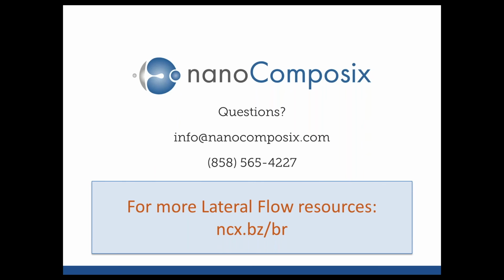Our first question comes from Andrew. For a competitive assay format, what conditions do you recommend for conjugation? For a competitive assay, we highly recommend covalent binding for the conjugate. For competitive formats, it's really important to limit the amount of antibodies per particle because that can actually improve your sensitivity. Decreasing the amount of antibody and incubation time can cause regular passive conjugates to be unstable. So by using covalent conjugates, you have a lot tighter control over that.